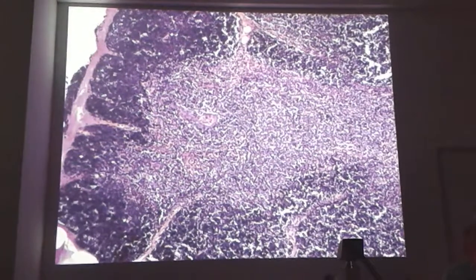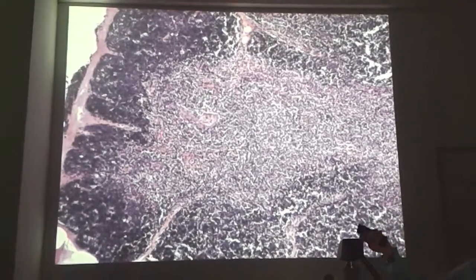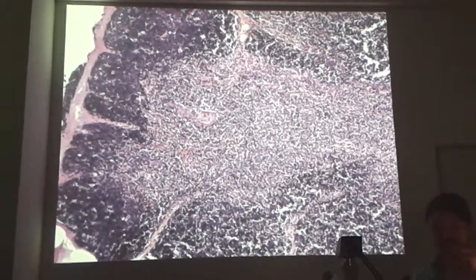When they come together and concentrate into each other, they make a whole of epithelial cells to form Hassall's corpuscle. Okay? So in this first slide, all you have to know is that the thymus's parenchyma is made up of cortex and medulla. In the cortex, you will see lots of T cells, and in the medulla, you will see macrophages, dendritic cells, but fewer T cells. You should also try to find Hassall's corpuscle, which are concentrated epithelial cells. Okay? And let's go to the second slide.